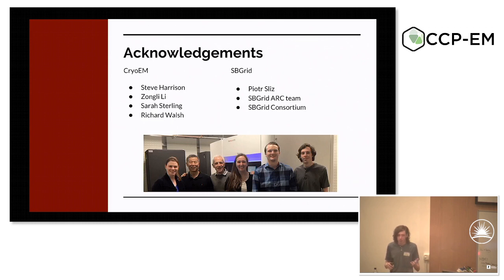And I think that's where the machine learning community could really help us, because I'm not a machine learning person, but it feels like that should be a solvable problem just by looking at enough different 2D classes and being able to work out what looks good in general versus what is junk.